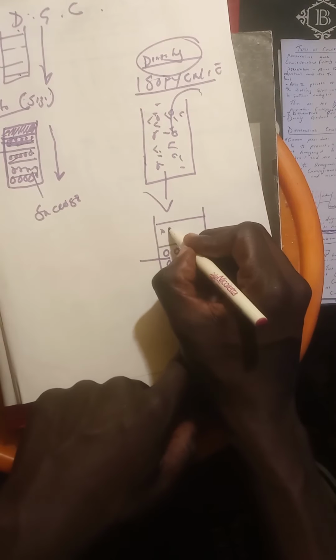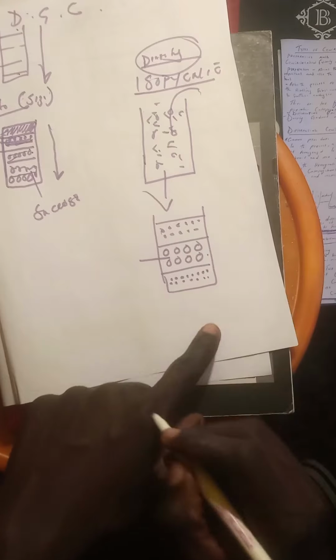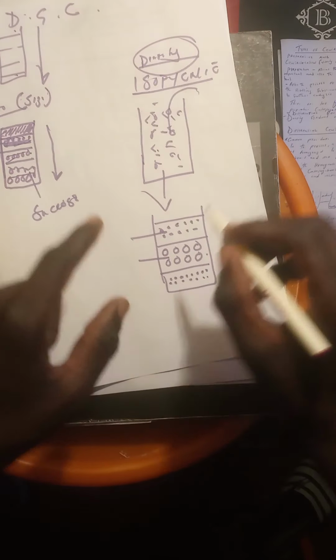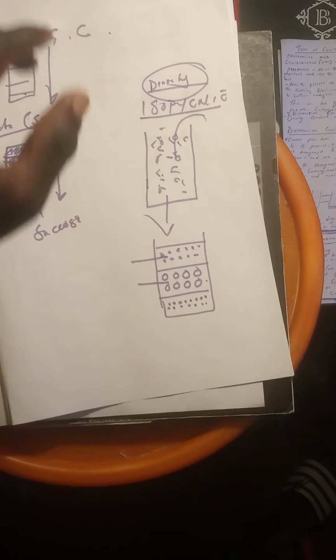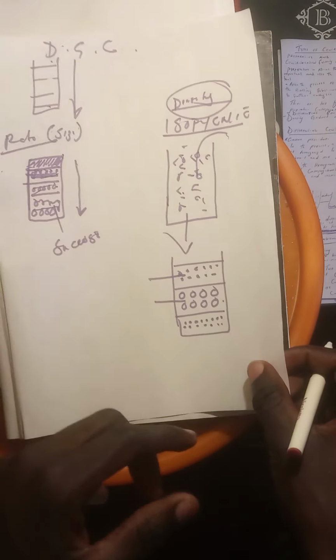If you have maybe this type of components corresponding there, then you have that there. So this is entirely based on density rather than based on size. So these are the types of divisions in the preparative centrifugation.